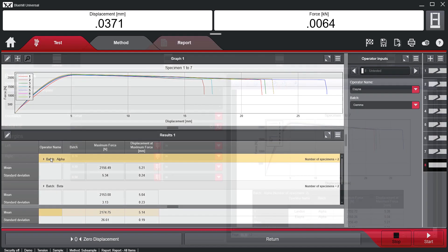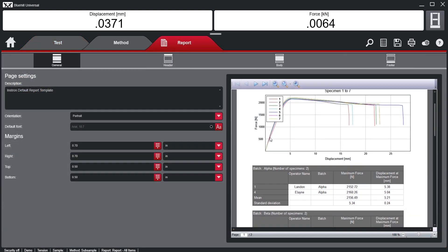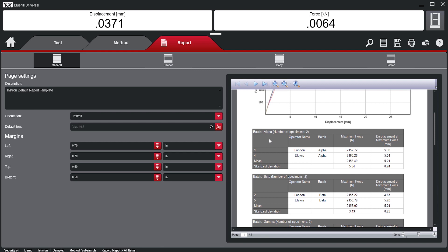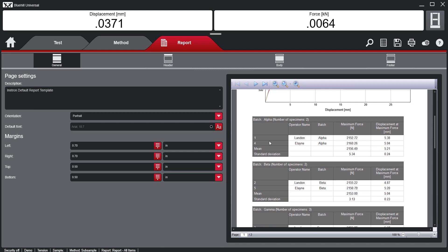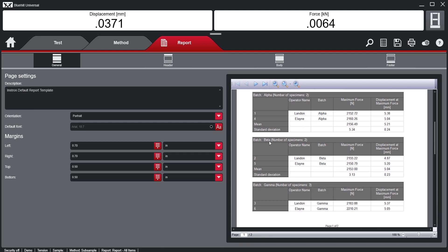The subsample data will also be reflected in the report and can then be exported with sample statistics, test curves, and any other required information.